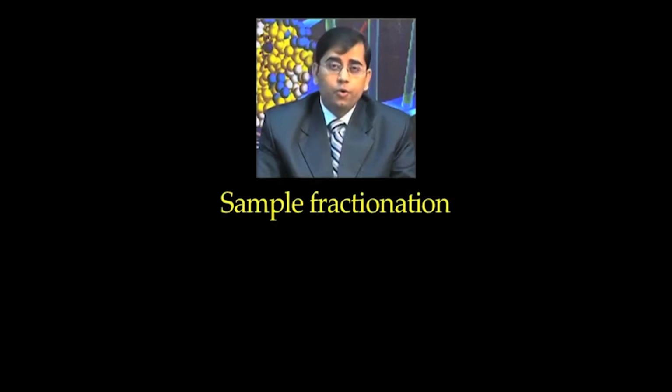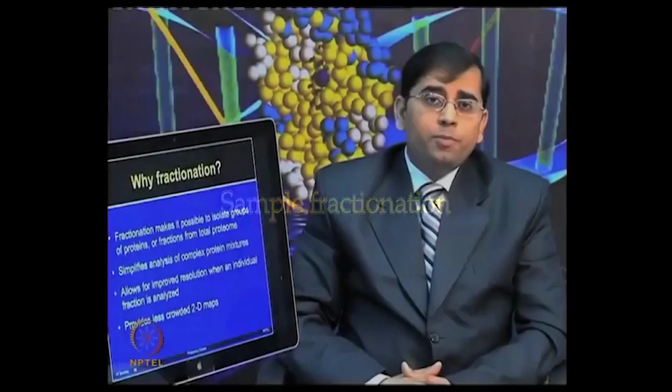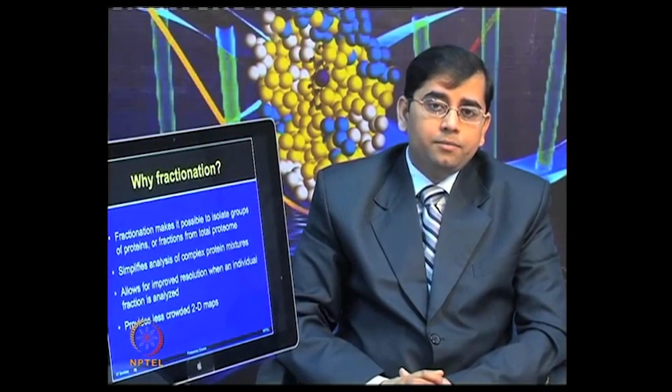Or if you are looking for wide proteome coverage, but the proteome poses a lot of challenge in separating all the protein mixture simultaneously, then one needs to do fractionation to reduce the complexity of the sample. So, why perform fractionation?